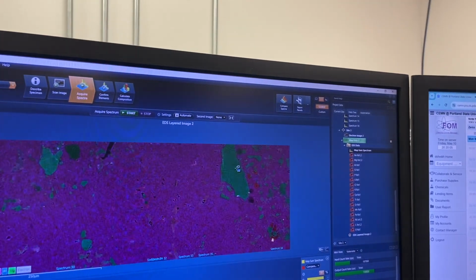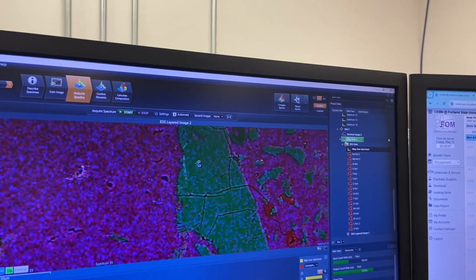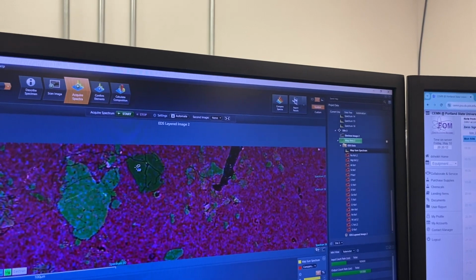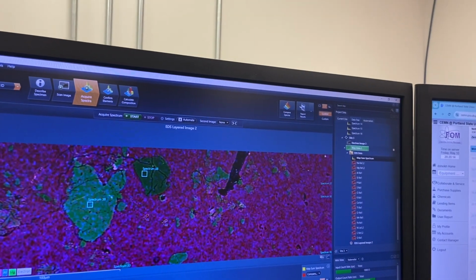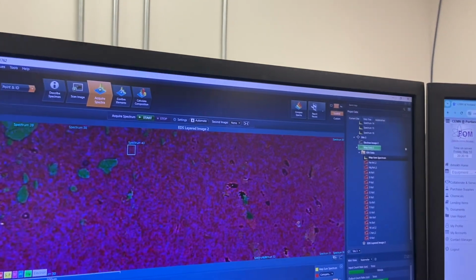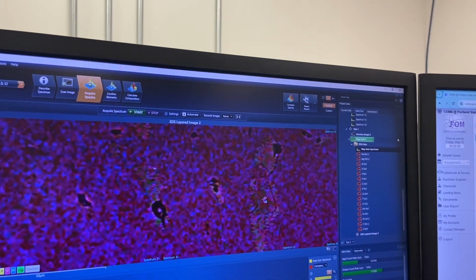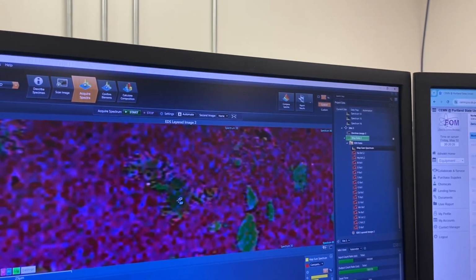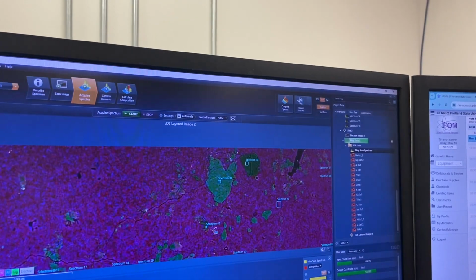right, let me get just a few more. I know I've already been getting quite a bit, but just something like that. And then that, and then one more feldspar here. Let me get one more pyroxene. This works. Let's get that. Let me get a magnesium pyroxene. Like that. There. Perfect. All right.